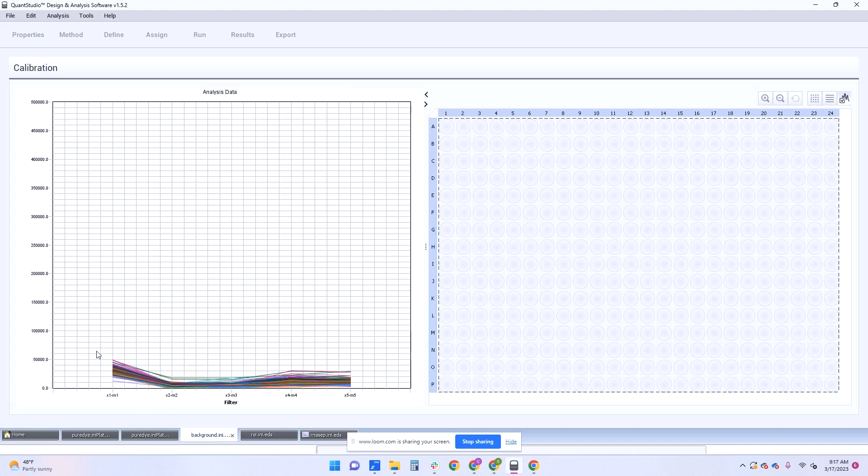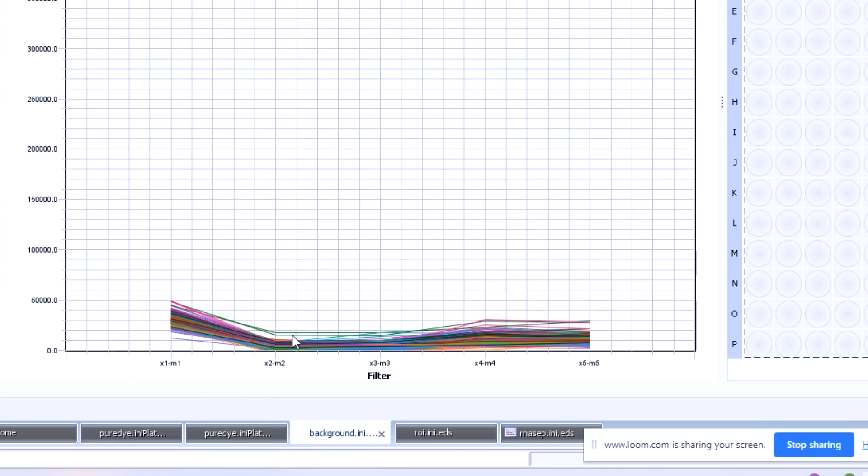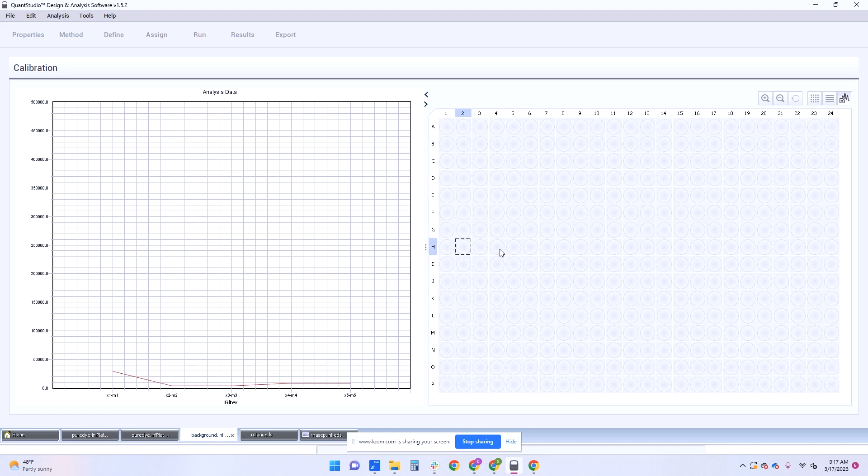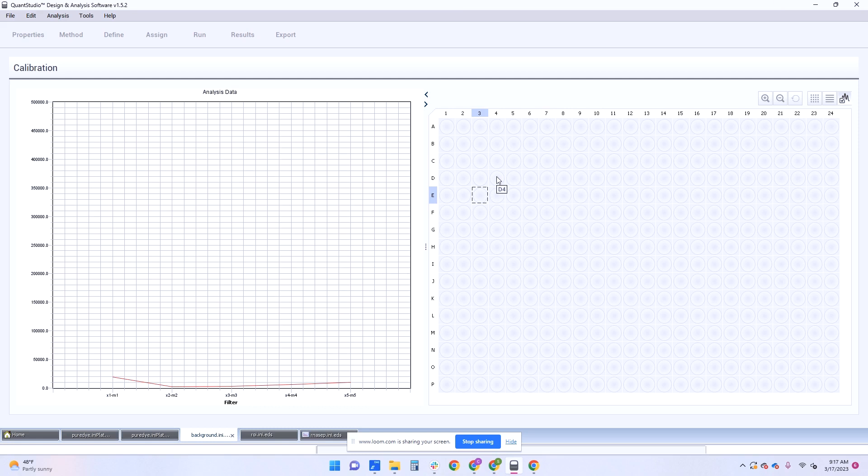So you can tell if you have high background on your instrument by doing this check and you can see a very tight band over here so that's good. If you had absorbance high in these areas, then you know that you can target specific wells and see if there's any extremely high background on a specific well and then you can go in and you can clean that well.